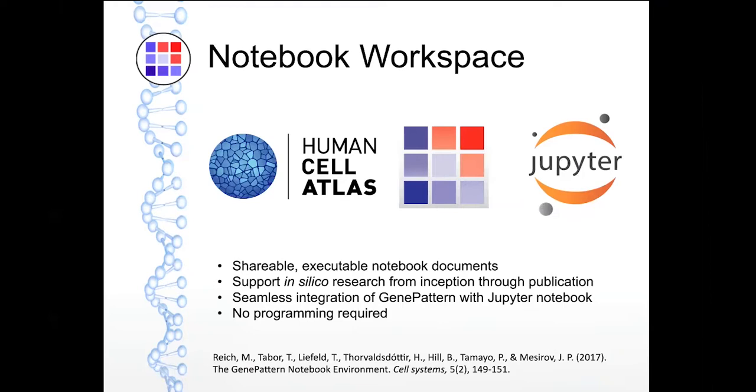One of the things that we are doing to support this is that we're building a library of single-cell notebooks that will encapsulate all the facets of single-cell analysis, from pre-processing to clustering, and from visualization to trajectory analysis. Many of these approaches were developed in coordination with the HCA.